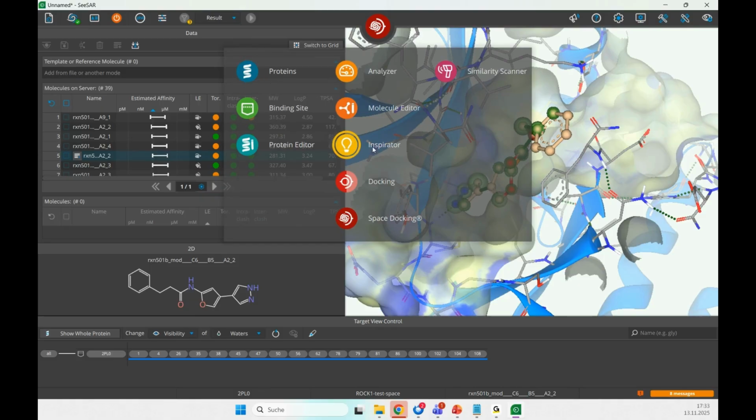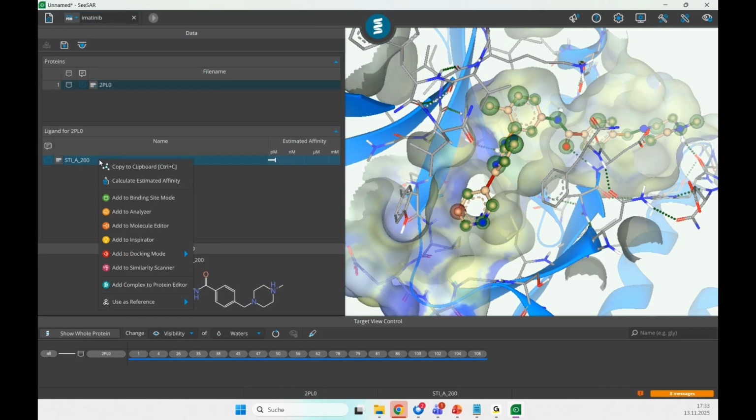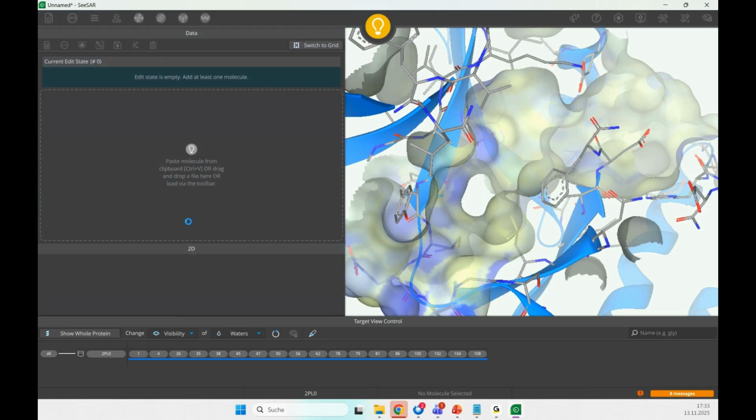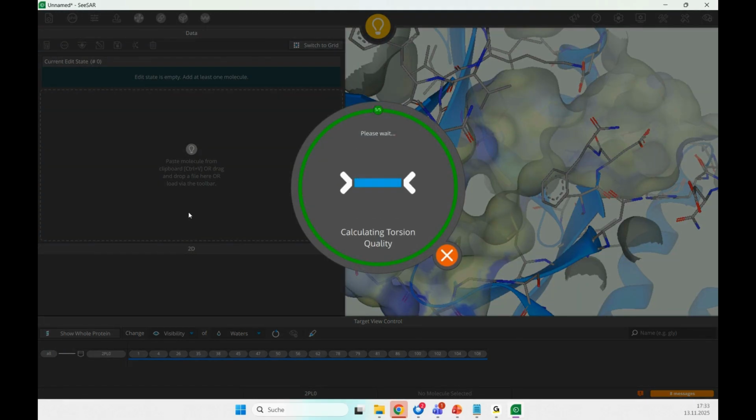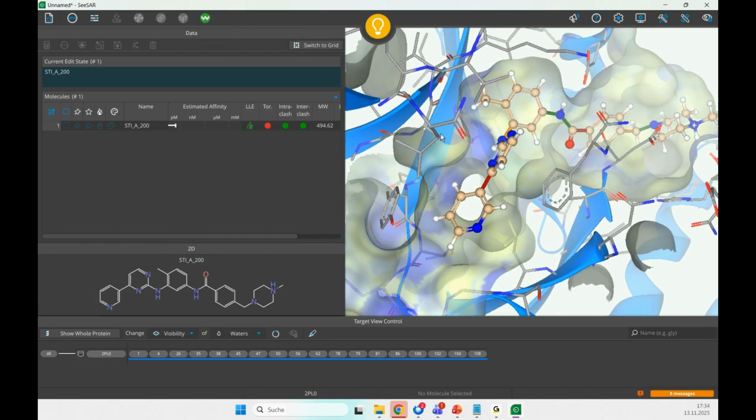And if I click on it, you will see the name of the compound has changed. This explains what it did. It exchanged the phenyl moiety for quinazolinone. You can see it here. The modification is also highlighted. And it goes on explaining what it did. So basically, those are smaller modifications up to the size of adding a phenyl ring system. So a maximum of 6 additional carbon atoms.